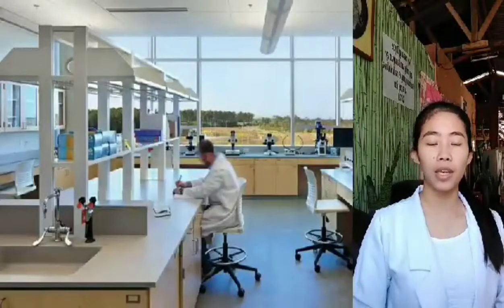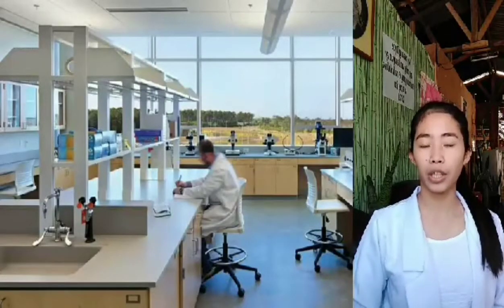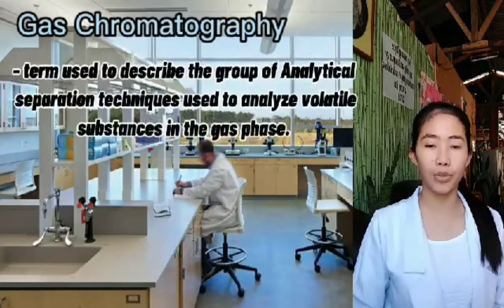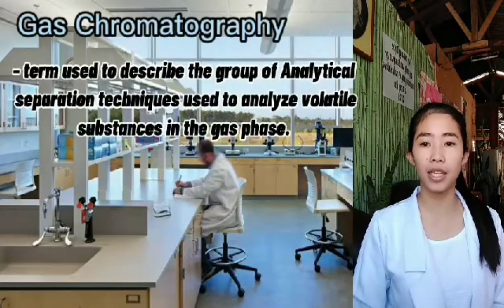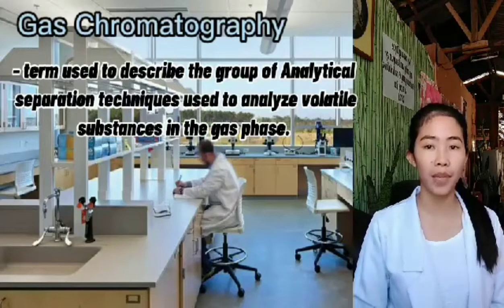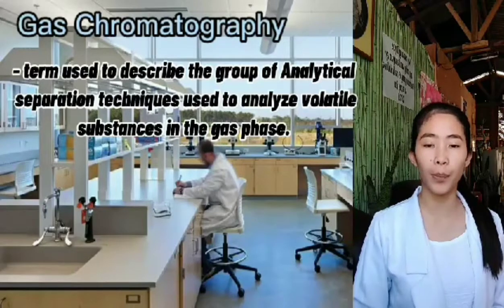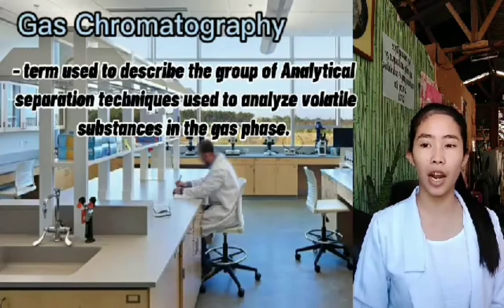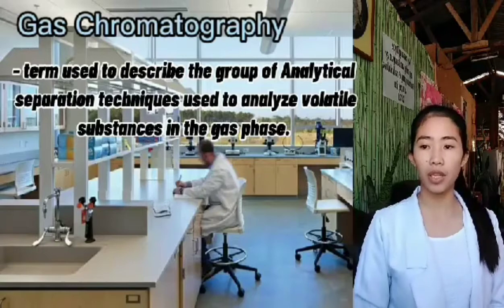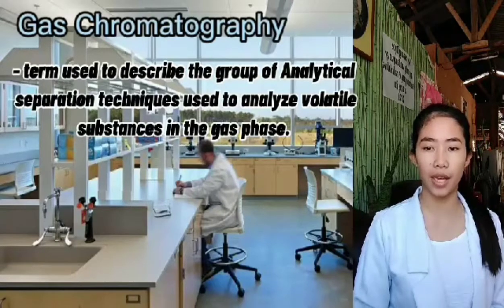Good morning everyone. In today's video, we will be learning about gas chromatography. Gas chromatography is a term used to describe the group of analytical separation techniques used to analyze volatile substances in the gas phase. In gas chromatography, the components of a sample are dissolved in a solvent and vaporized in order to separate the analytes by distributing the sample between two phases, the stationary and the mobile phase.